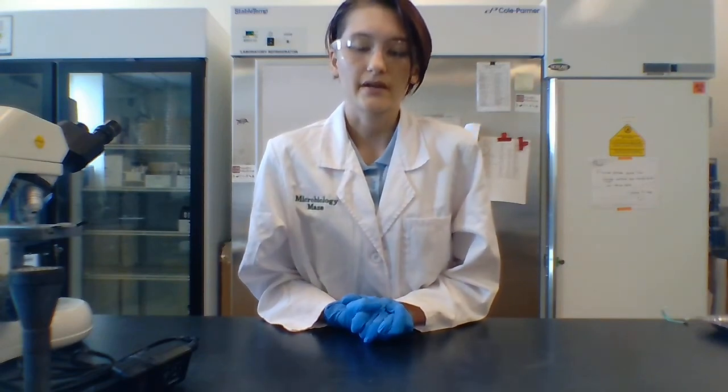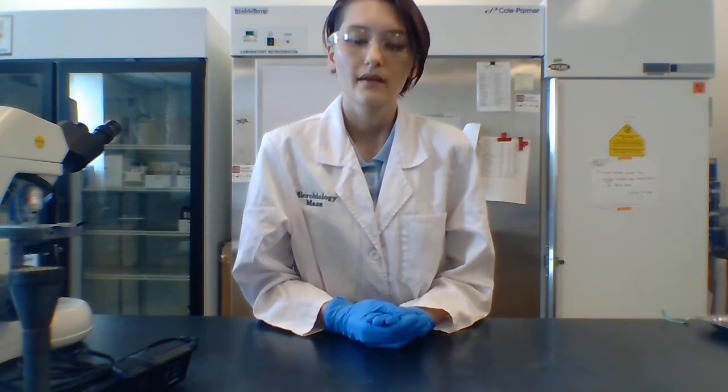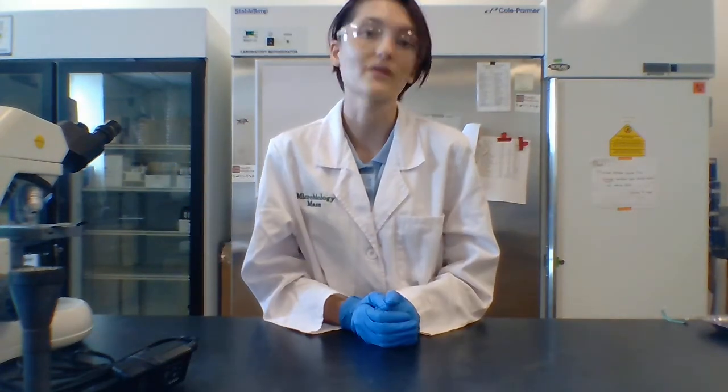So, now that we know the basics of lab, that concludes this video. So, we went over how to set up for a lab safely, how to take and culture a sample, and how to examine that sample. So remember this next time you're curious about this invisible world that is all around us.